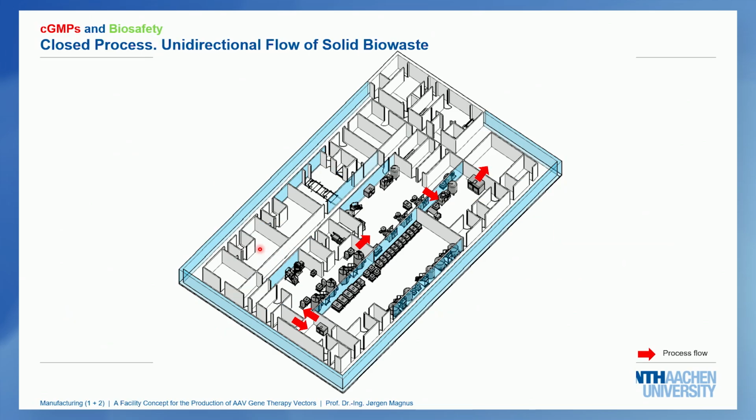Looking at GMP requirements and biosafety requirements, these are often considered together. So closed processing, we mentioned, is a very important measure to take, first of all, to protect the product.